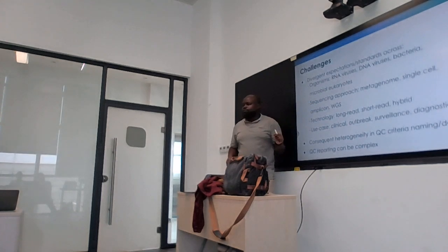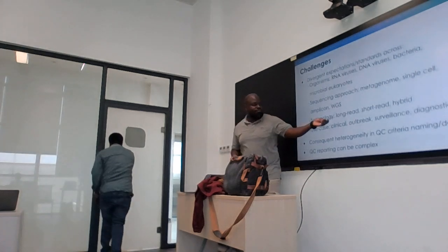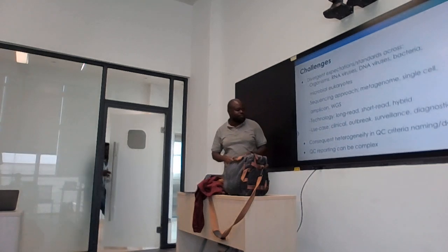You've done whole genome sequencing, you've done metagenomics, for example, right? They're different. The quality thresholds are going to be different, okay? The technology, I've given an example of maybe like ONT. You have PacBio, you have Illumina, you see, different technologies.